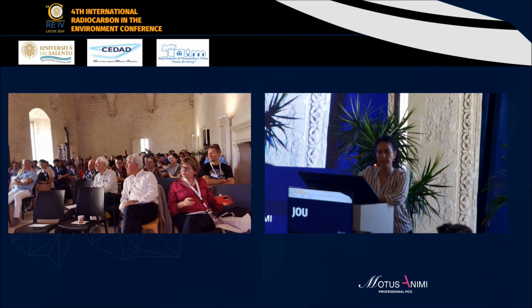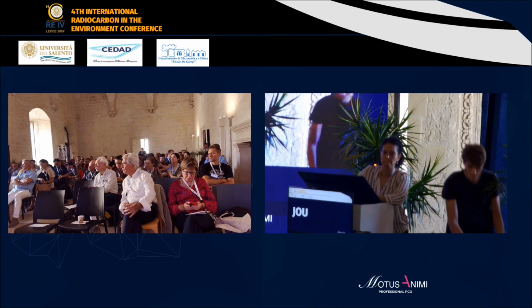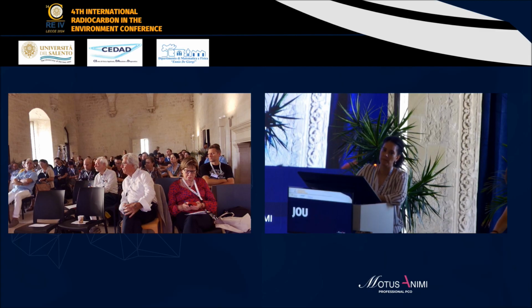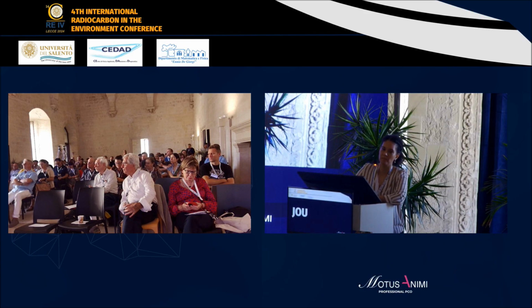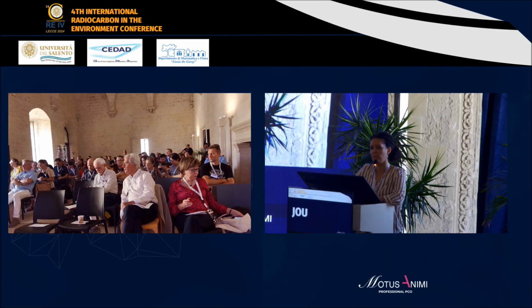I would like to comment on what Walter was asking. We are doing it here, in Italy at least, in our lab. We are measuring biofuels on a routine basis, mainly for different Italian petrol companies, mainly for kerosene for aircraft. The problem is that usually the bio concentration is quite low, and you have some more problems in correction for background because you have 1-2% or even lower bio concentration, and this raises some problems in the calculations. But we are doing it on quite a routine basis.